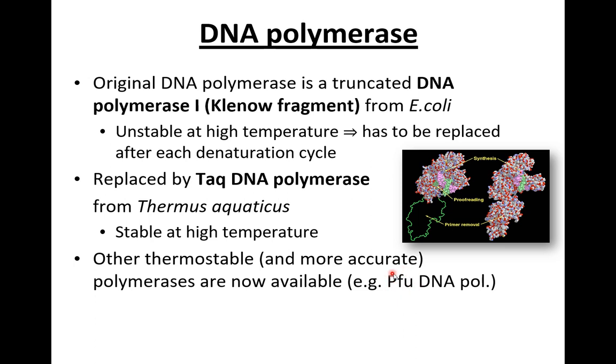That's where the name comes from, Pfu DNA polymerase, which, similar to Taq DNA polymerase, is resistant at high temperature, but it has an advantage compared to Taq DNA polymerase: it has a 5 times lower error rate. So Taq DNA polymerase basically introduces a wrong nucleotide every 9 to 10,000 nucleotides. The Pfu will be 1 every 50,000. So if you want, let's say, to amplify a sequence of DNA so that then you want to clone it to express a gene and so on, then you most likely use a Pfu, not a Taq DNA polymerase.